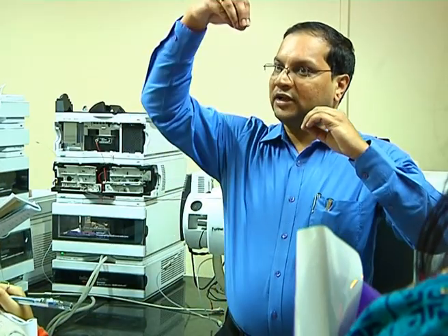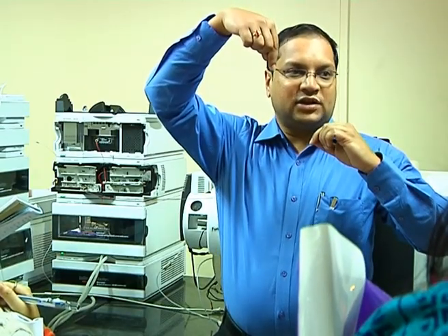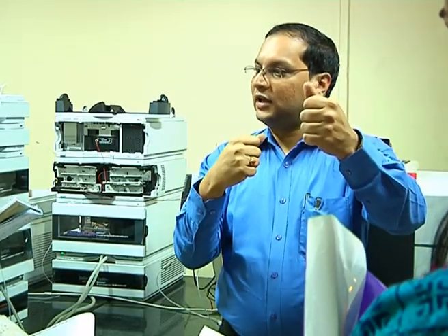So what is being done here is a stream of liquid, then there is a nebulization gas which is nitrogen, and that liquid is sprayed, like a perfume spray sort of thing. You are pushing some gas around that nozzle so that it gets sprayed off. So you have split the stream of flow into a small spray, and the source is heated at typically 300 degrees centigrade.